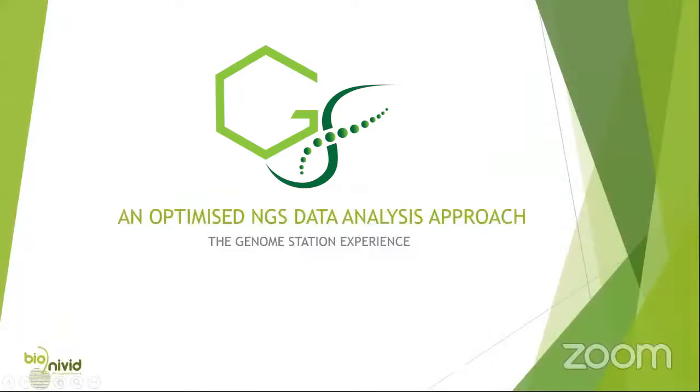An optimized NGS data analysis approach, the Genome Station experience.